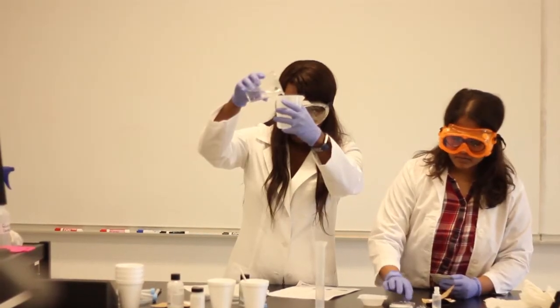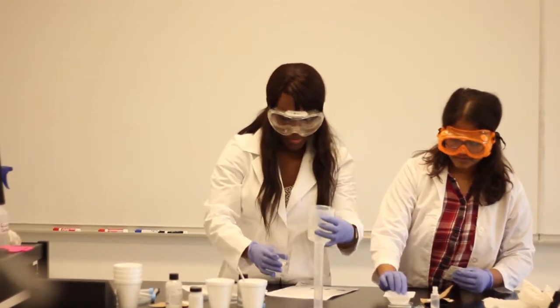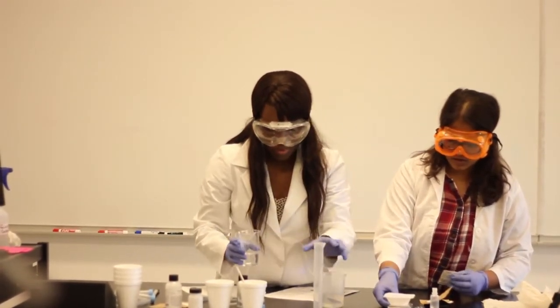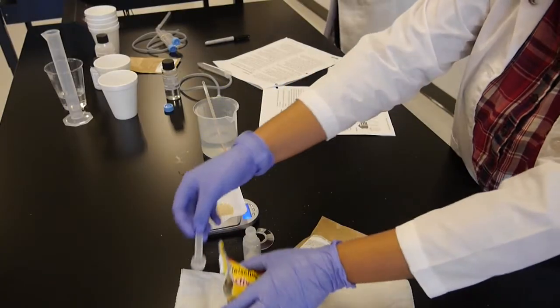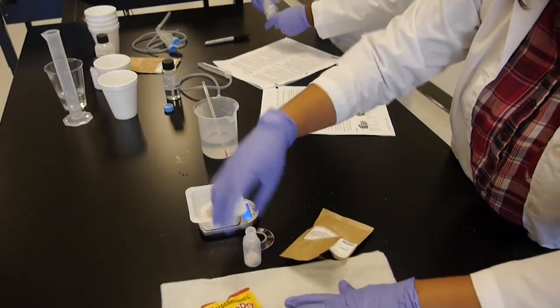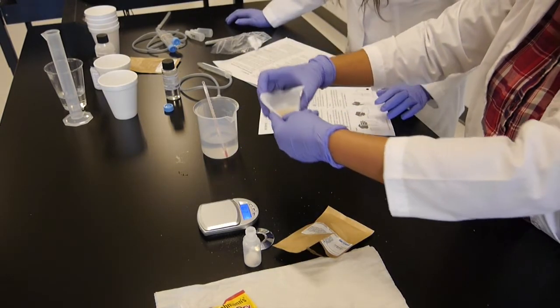In the meantime, let me weigh out about 2 grams of yeast. Let me tare it. There we go. We have about 2 grams of yeast. Let me add it to the water.